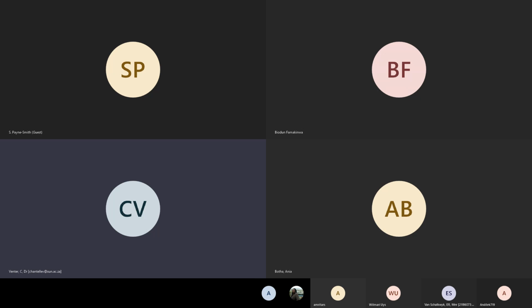And also, even depending on if you're going to stain your cells or just view them as is, this confocal at Stellenbosch can also do that. So maybe some fluorescent microscopes with this little case around them that can monitor your CO2 and temperature you can also use. So here in Stellenbosch, I would suggest using the confocal, but if you are at a facility that maybe has a fluorescent microscope with one of these incubated cases around them, then that will also be something that you can use.